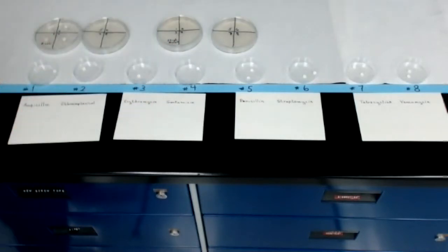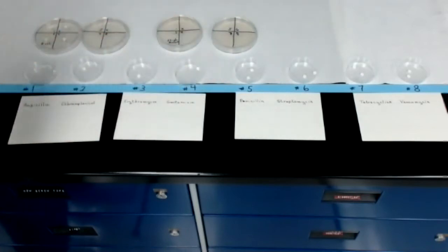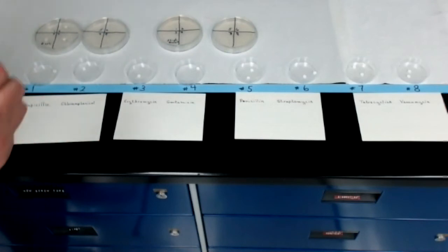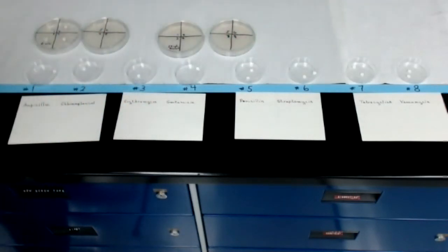What I'm going to do off camera is I'm going to finish transferring all these discs to the proper quadrants on the proper plates. When I'm all done, we are going to see that the E. coli that we're working with is being exposed to 8 different antibiotics, and the Staph aureus that we're working with will end up being exposed to the same 8 antibiotics.